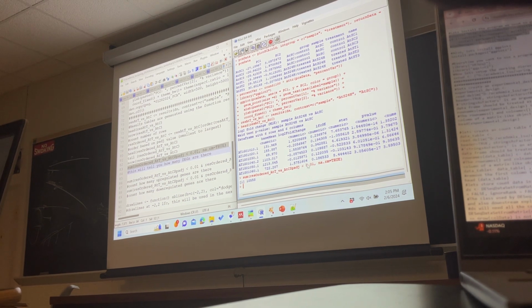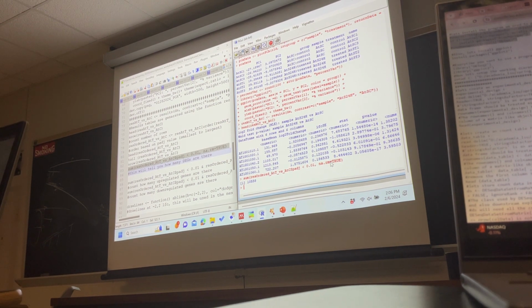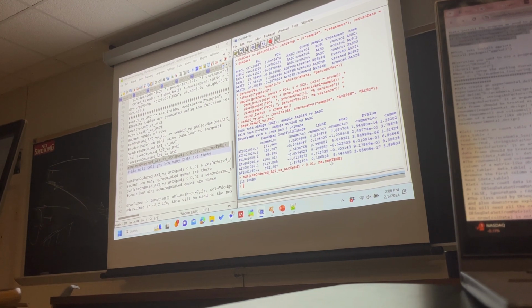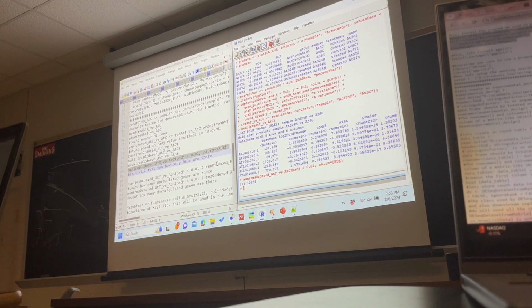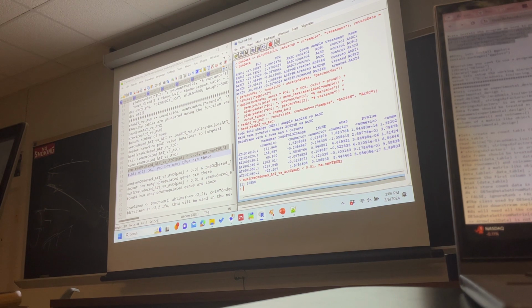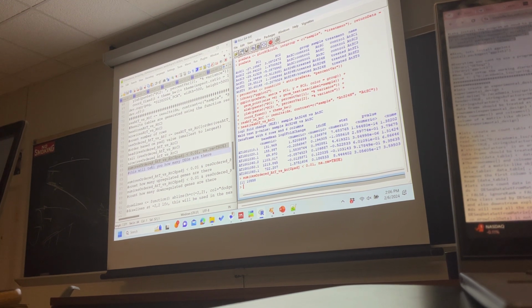You can put a log2 fold change cutoff. Some people also put a log2 fold change cutoff: if the log2 fold change is greater than 1, then only consider those differentially expressed genes. Right now I didn't put any, I usually do not put any expression threshold there. It doesn't matter if it is a lowly expressed or highly expressed gene. If it passes the p-value threshold, I always consider those as DEGs, but it depends on what you are trying to get.